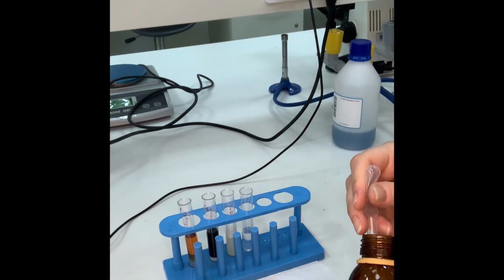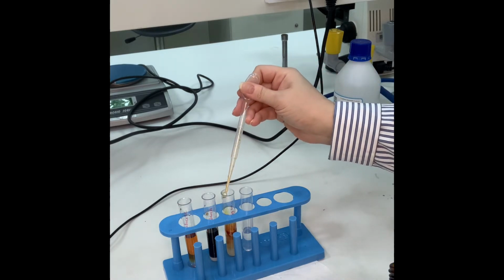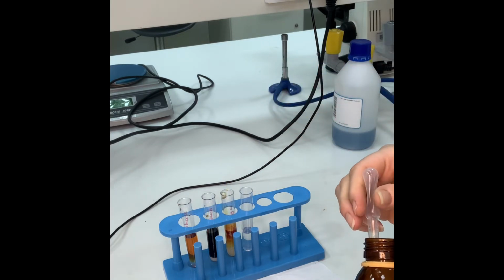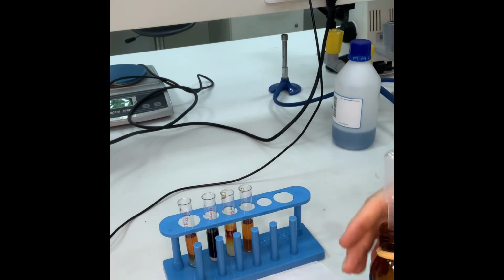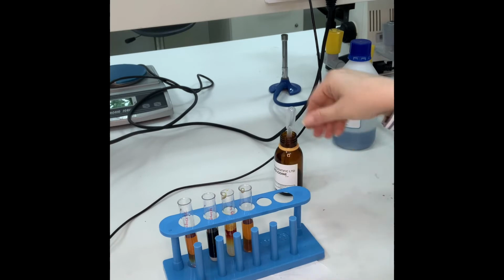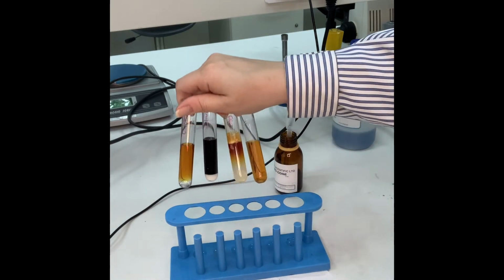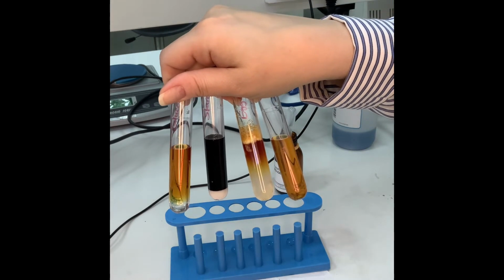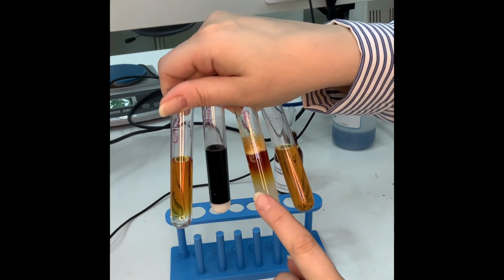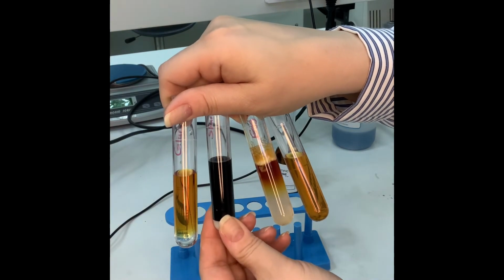reduction. This is the egg white, and this is the negative control. I'll try to hold them all together. So as you can see, no change to glucose, no change to egg white, and of course this is my negative control. This is the starch solution.